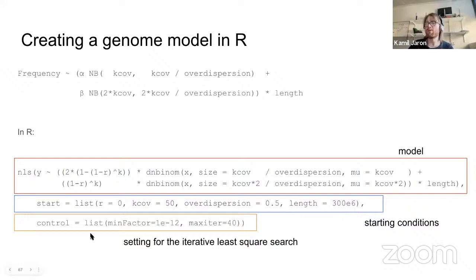And you just give it some settings for the iterator of how it should behave. You don't have to overthink that, but you can dig into it if you would like. It's almost like a Markov chain. You can play with how exactly the optimization algorithm works. It goes really beyond this tutorial, but it's philosophically not complicated. It's just practically complicated.